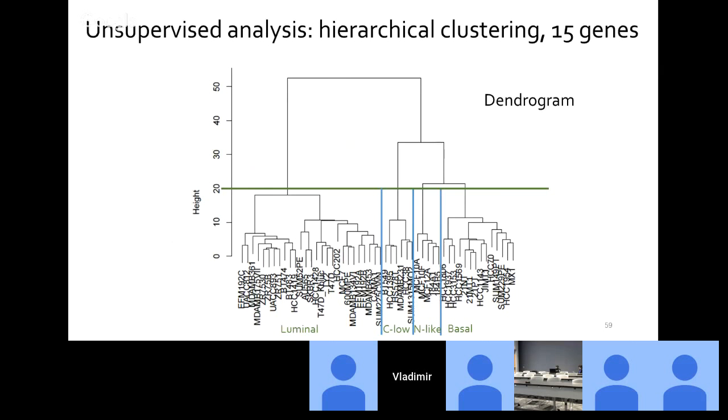Then we limit our focus to this much smaller set of genes and do clustering again, and optimally have a slightly better grouping of samples as we're focused on the genes identified as informative ones.